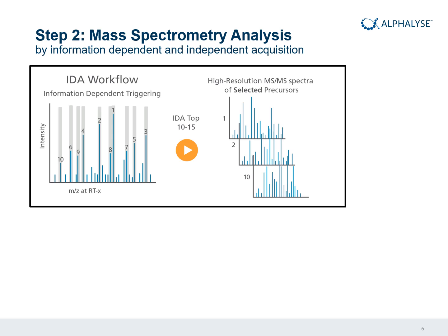Typically, when you run mass spec instruments and do peptide mapping, you would run it in what we call a data-dependent acquisition mode. This means that at any given time point, the MS instrument is scanning the MS1 to look at peptides, so it's identifying peptides by mass over charge. And then it's selecting individual peptides and doing MS-MS sequencing on each of those. It can typically detect and run 10 to 20 peptides in one round of analysis.